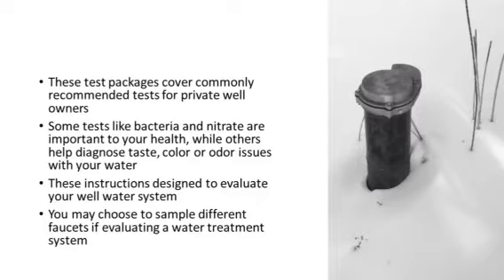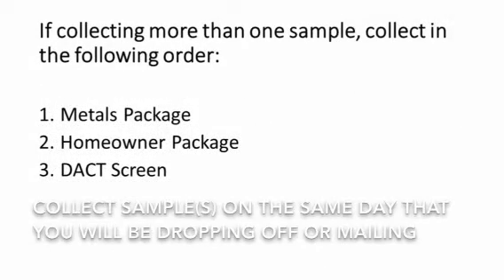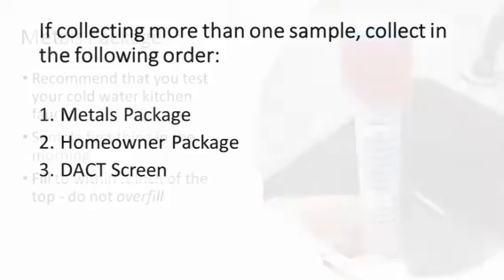However, if you're choosing to evaluate, let's say, a water treatment system, you may want to alter where you collect your samples from. If collecting more than one sample, we recommend collecting them in the following order. Metals package first, followed by the homeowner package, and then last the DACT screen.